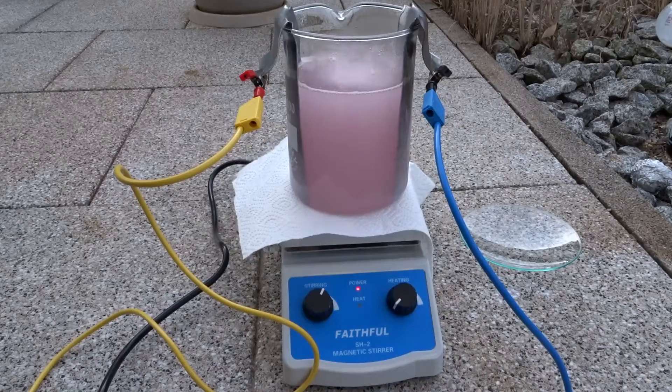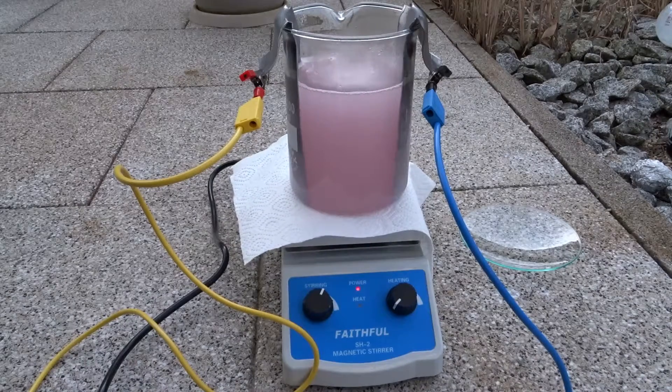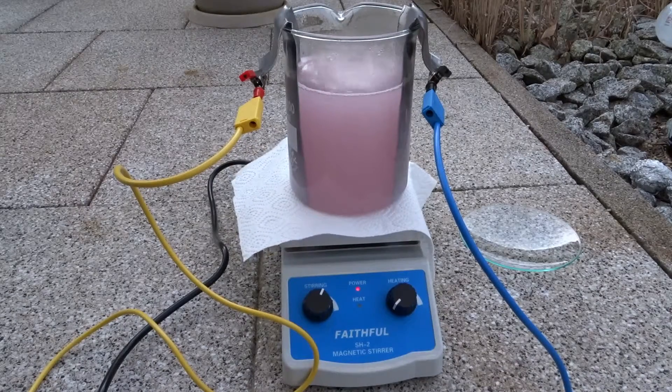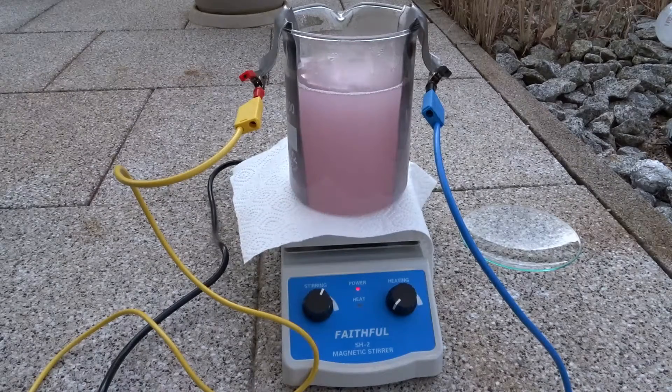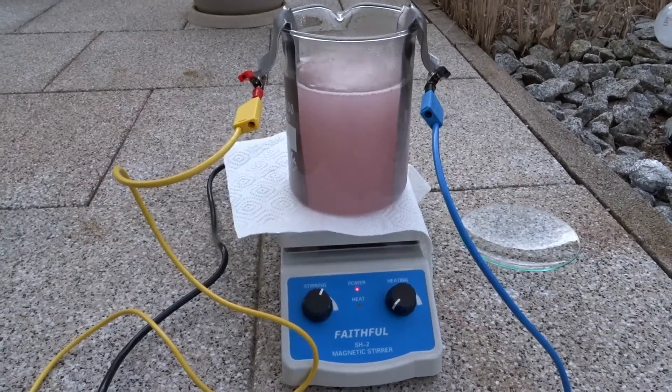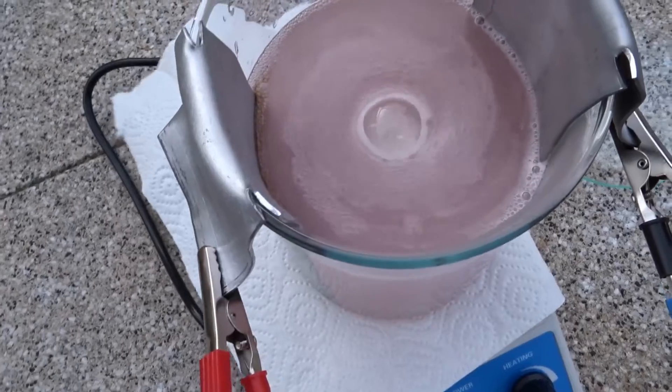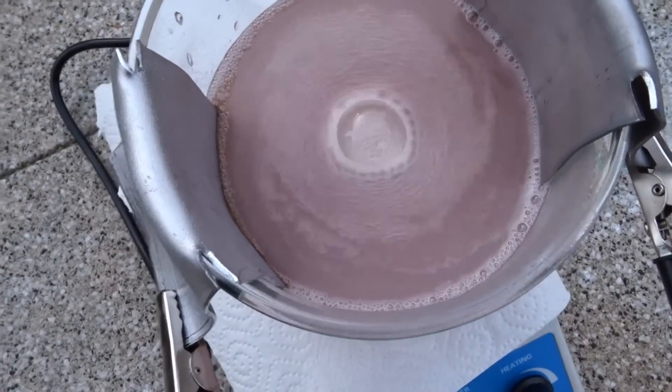Next step is to increase the voltage and check if there will be bubbling. You can see the first brown stuff forming.